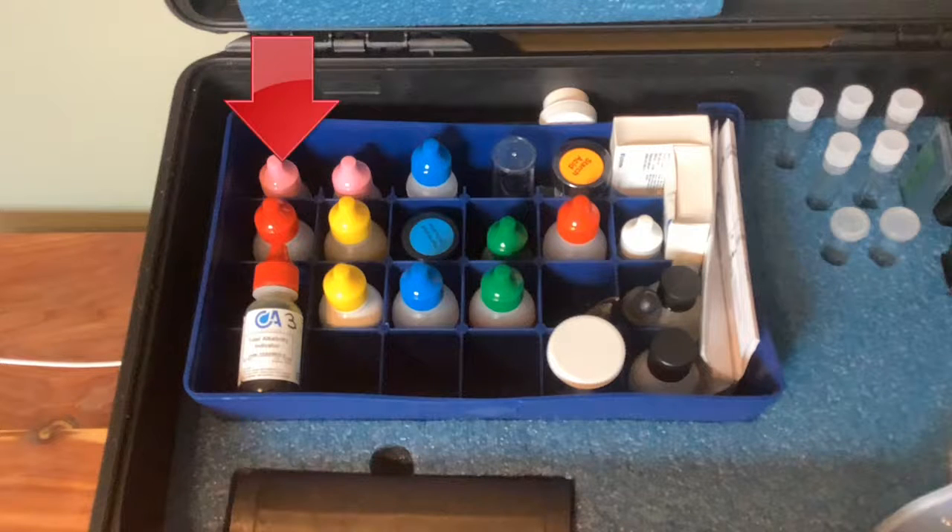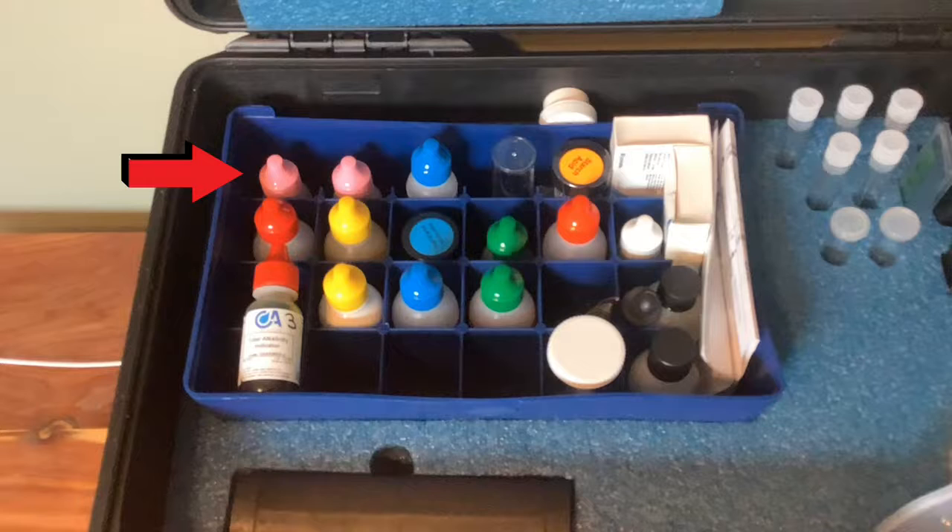For example, the first column on the left is the total alkalinity test, and as you move down the column, it correlates with the steps on the total alkalinity test. Start at the top with the drops of phenolphthalein, go down one row to the sulfuric acid, then down one more row to the total alkalinity indicator, finally back to the sulfuric acid to finish the test. A quick tip that comes in handy is to write the amount of drops needed on a specific bottle, like the number three you see on the total alkalinity bottle.